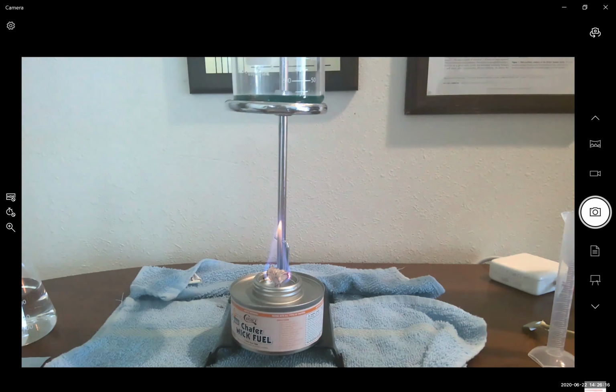Everything going okay? Remember, never reach above a lit flame, never reach around a lit flame, and never touch your sterno container while it is heating. It is very hot right now. It's quite a fun experiment. Sterno heaters are commonly used in camping, so it's a wonderful alternative to a Bunsen burner for these kinds of at-home lab box chemistry.